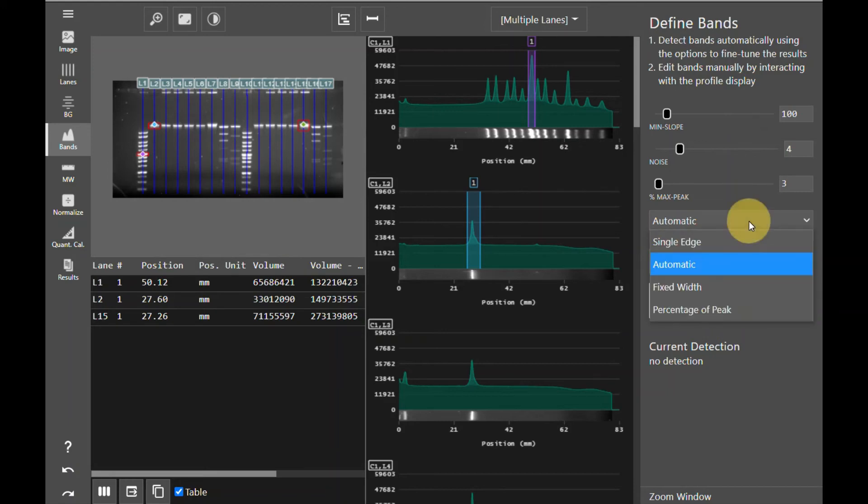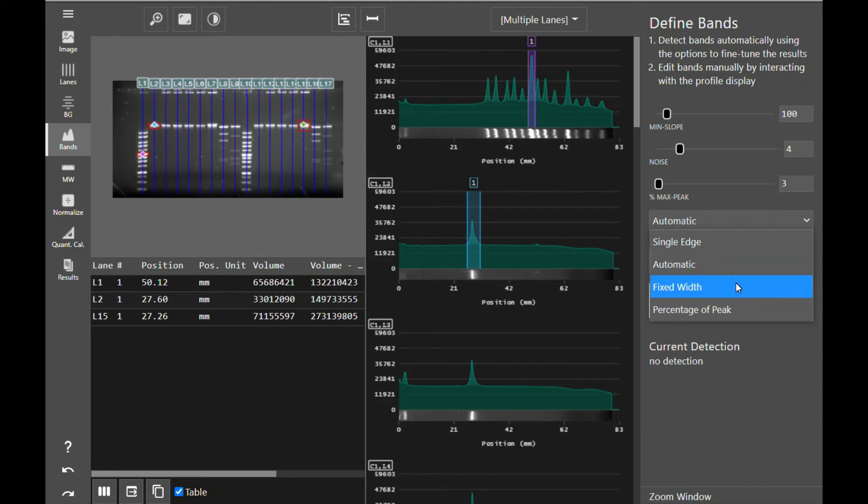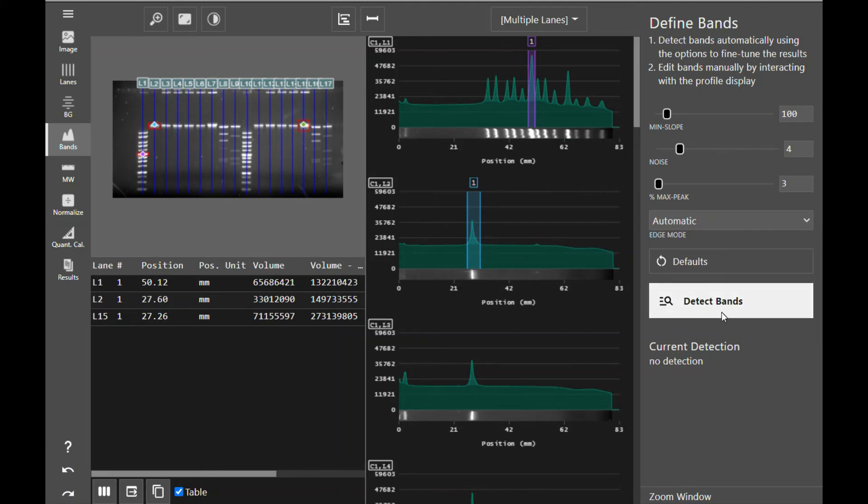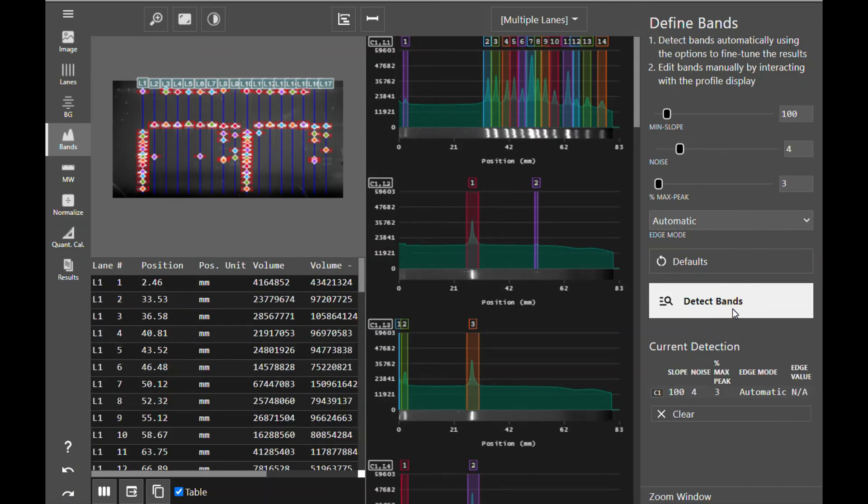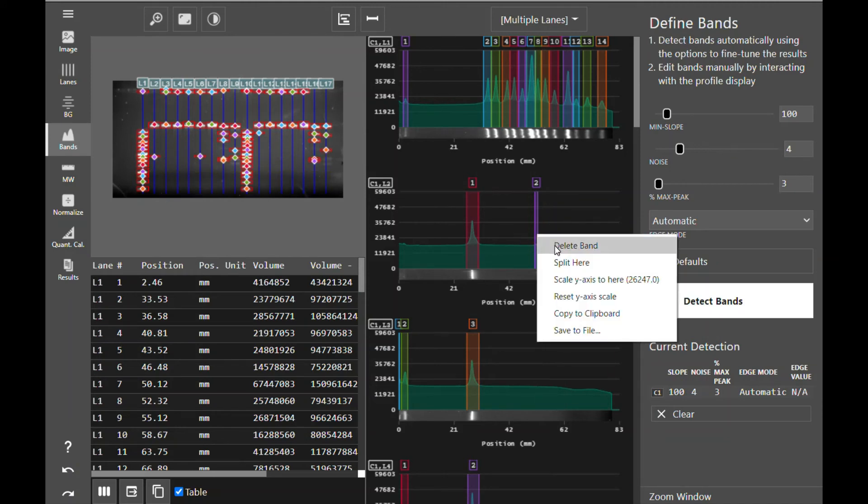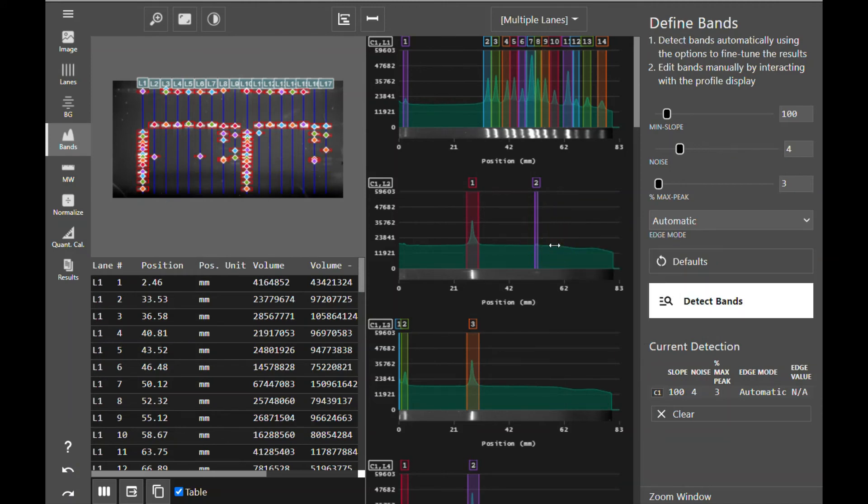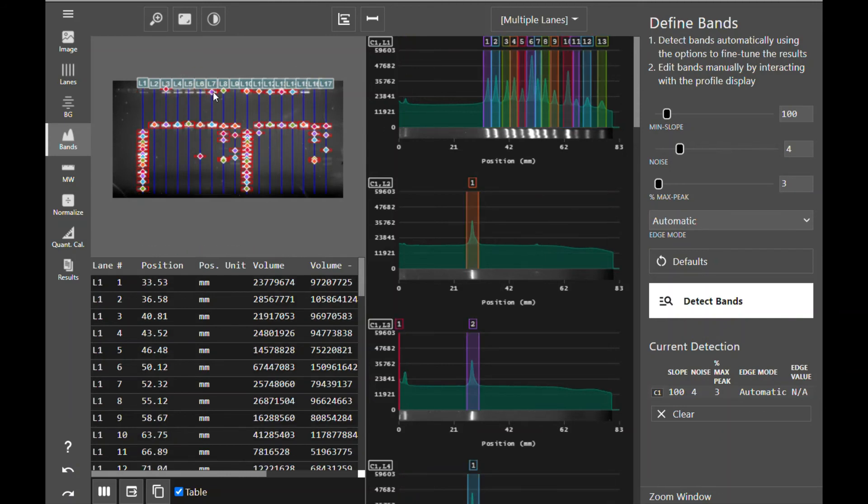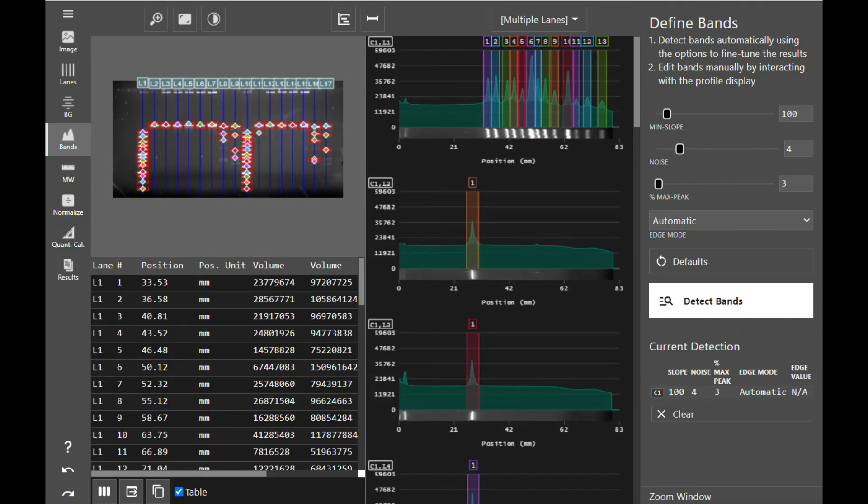Azure Spot Pro also gives you the option of automatically detecting bands according to your set parameters. You can choose different edge modes such as single edge detection, automatic detection, fixed width detection, which will create every band box to the exact same width, or percentage of peak detection. Once you've set your parameters, click detect bands to detect bands across the entire image according to your parameters. After detecting bands automatically, you can still interact with the profile and with the image to delete bands by right-clicking.